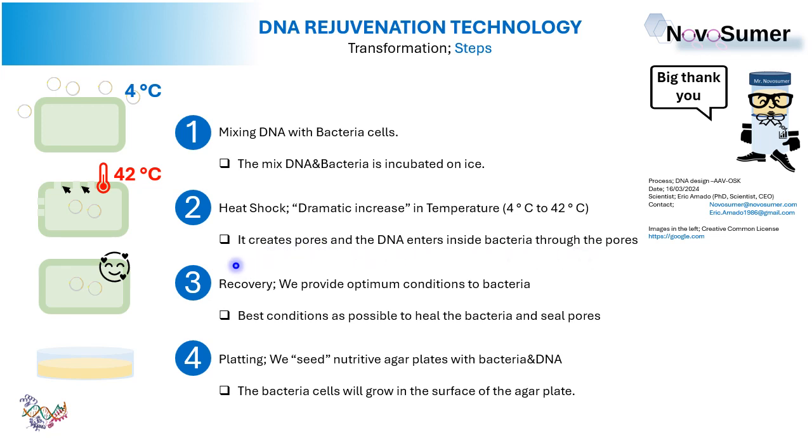That's it. Okay, let's go for the third step. Are you here with me in the third step? The third step is the recovery of the cells. We provide optimum conditions to the bacteria cells, a nice temperature, a nice environment. In this environment, the bacteria cells are able to heal and to seal the pores. You see it here. The bacteria are exposed to nice conditions and they recover and heal. So this is the third step.